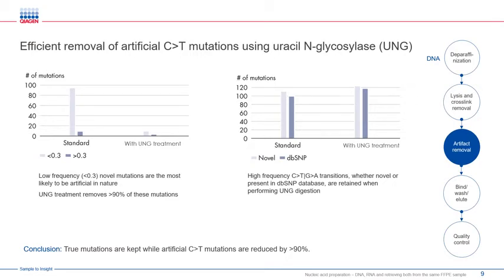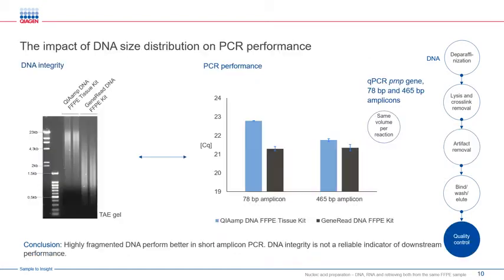And this you can see on the right. Here, these are the mutations, the true mutations, and those are not affected by the enzymatic treatment. We're now moving to quality control of the isolated nucleic acids.